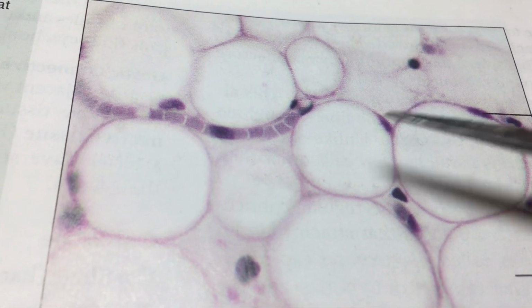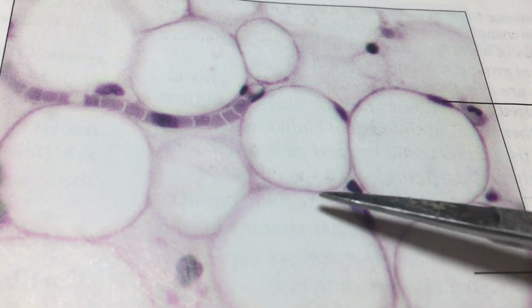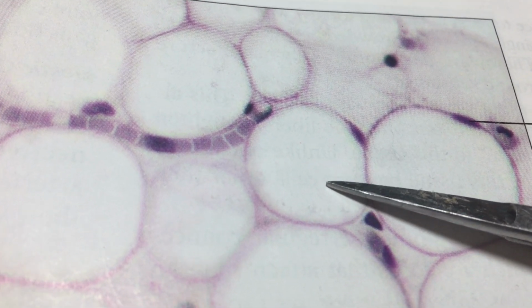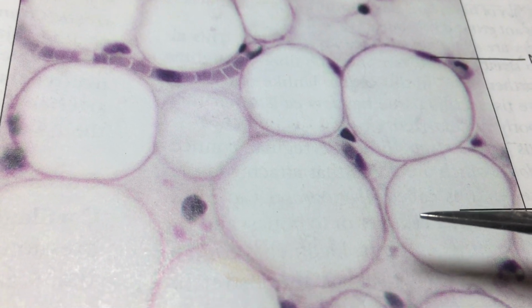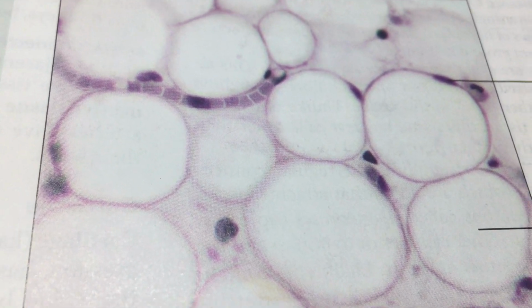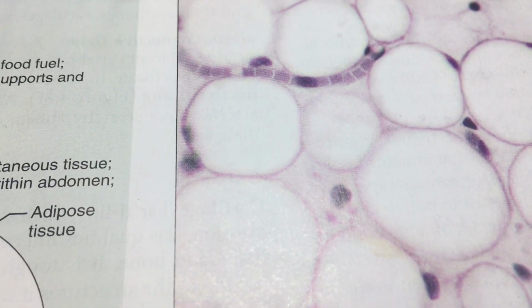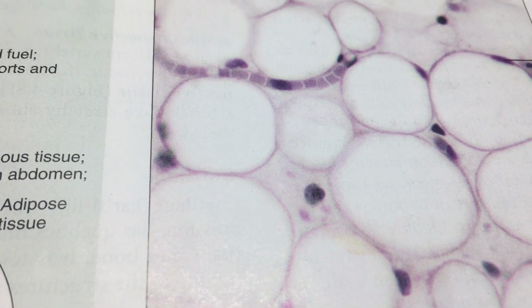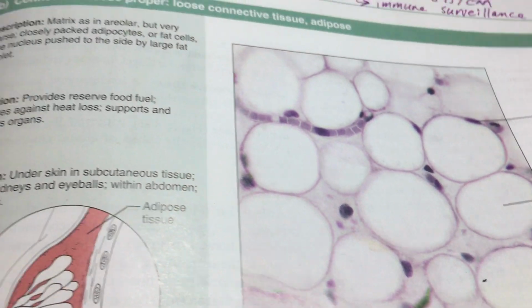remember back when we were looking at the lungs, it might be easy for you to mistake a simple squamous epithelium of the lungs with the adipose tissue. So take a look, compare, contrast, and see that you can actually not make that mistake so easily. Okay, so they slightly look alike, but not that much if you look closely. Do your due diligence and learn the visuals.